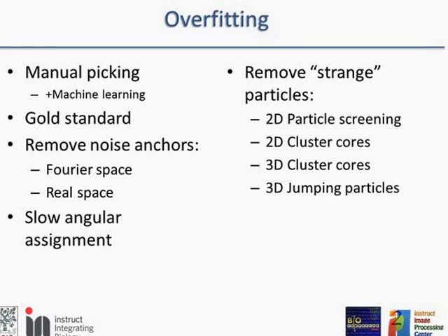And the same you do in real space. Normally you can put a mask and say, outside this mask I know what I have is noise, so remove everything there. I don't want you to feed anything in there. And you can extend these ideas to any space that you like. The wavelet space, you can impose a sparsity there or whatever.